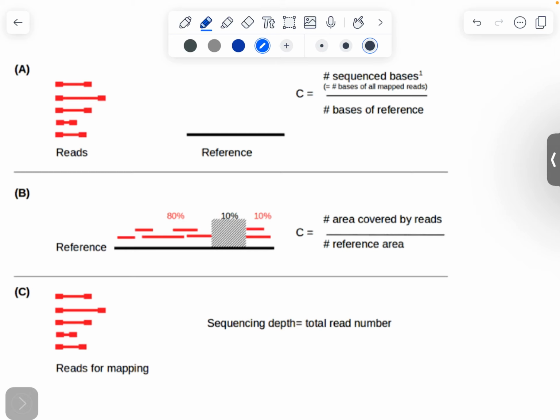So this is about next generation sequencing. There are 3 steps, and the third step is called data analysis, which requires computational methods to analyze the data. In our upcoming videos I will discuss how to analyze the data. Okay, thank you so much.